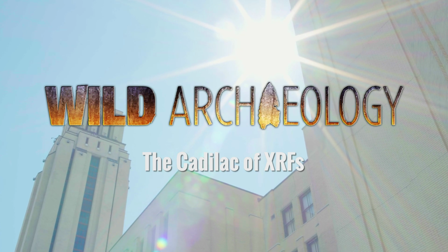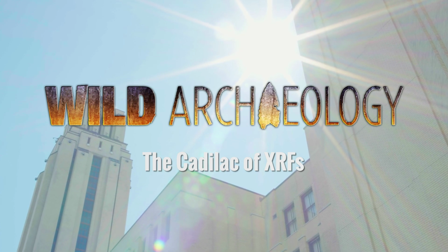I was pretty excited to go to Adrian's lab at University of Montreal. He has a full-out X-ray fluorescence instrument.